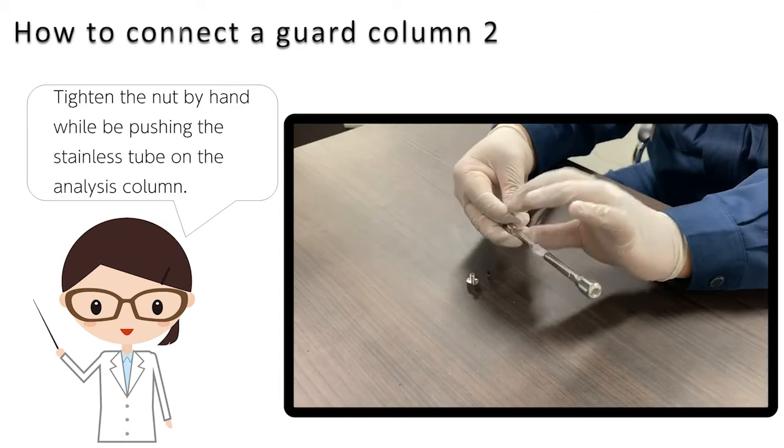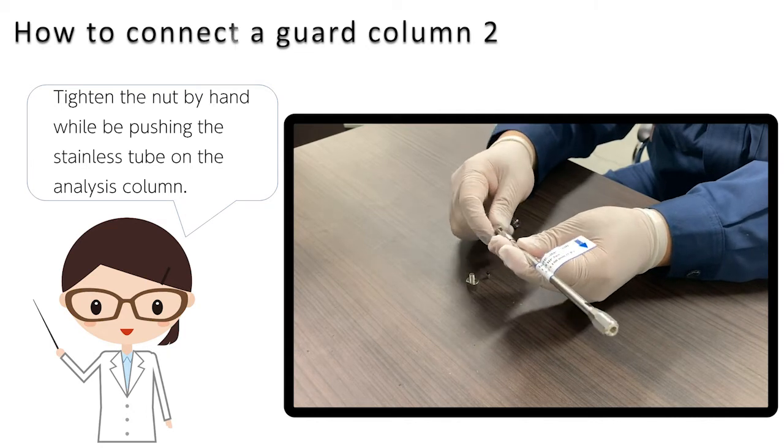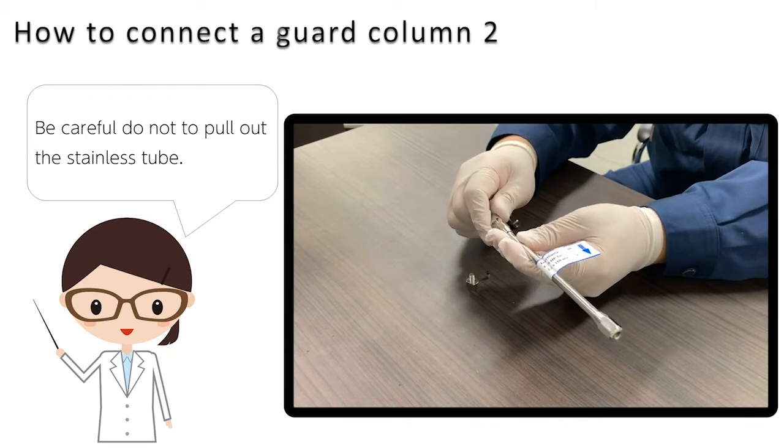Tighten the nut by hand while pushing the stainless tube onto the analysis column. Be careful not to pull out the stainless tube.